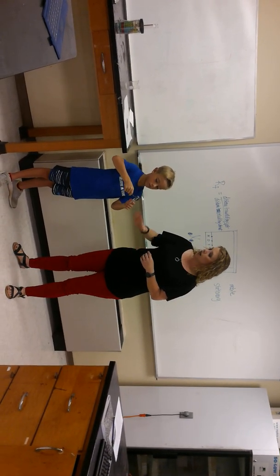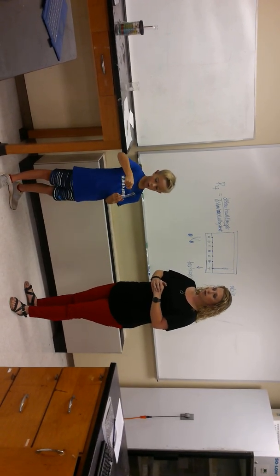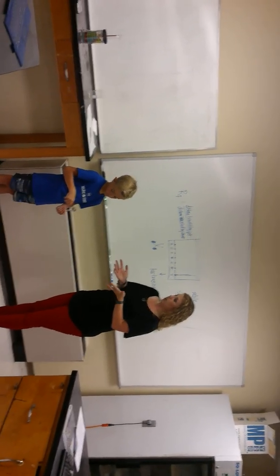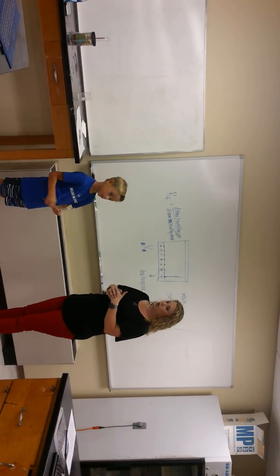And once we get it on there, we can let go of the test tube, but what do we not do? We don't squeeze the holes in it because it can come out of the grip. And then we've got to start the experiment all over again, and we don't want to have to do that because that's more of our time, right? All right, so be very careful you don't squeeze the test tube holder again once you've got it there with the test tube.